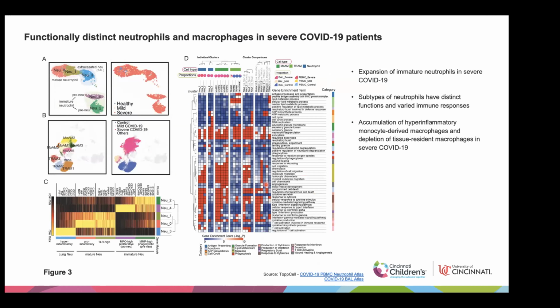Here I want to show a more specific zoom-in view for specific cell types. For example, it was widely reported that neutrophils and macrophages were attributed to the cytokine storm in severe COVID-19 patients, which can induce very severe symptoms. And we just extract those 2 cell types.